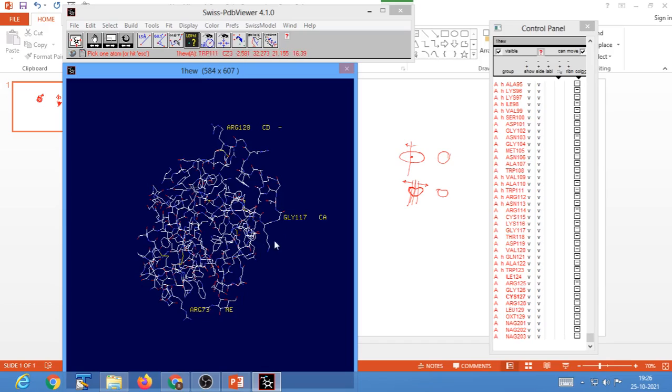One more thing that I would like to clarify is that your rotation or movement buttons are disabled when you use any of these functions. Therefore, make sure that whatever atoms you want to click are in proper view before using any of these functions. Look, I am trying to rotate my molecule now, but it is not possible.